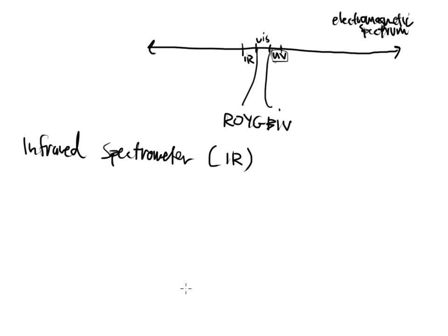Now, you're probably wondering, well, what's the purpose in this now? I mean, if it is a different part of the electromagnetic spectrum, it's probably relaying to it different energy. So what would the infrared do that the UV vis is not doing? So the UV vis is giving us what we're calling quantitative work, meaning numbers. It gives us concentrations of things. The infrared, it doesn't do that. I can't really get a concentration of something. What it does do, though, is it IDs parts of the molecule.